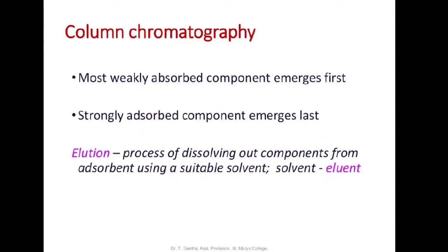The solvent is also called an eluent, and the process of dissolving out components from the adsorbent using a suitable solvent is called elution.